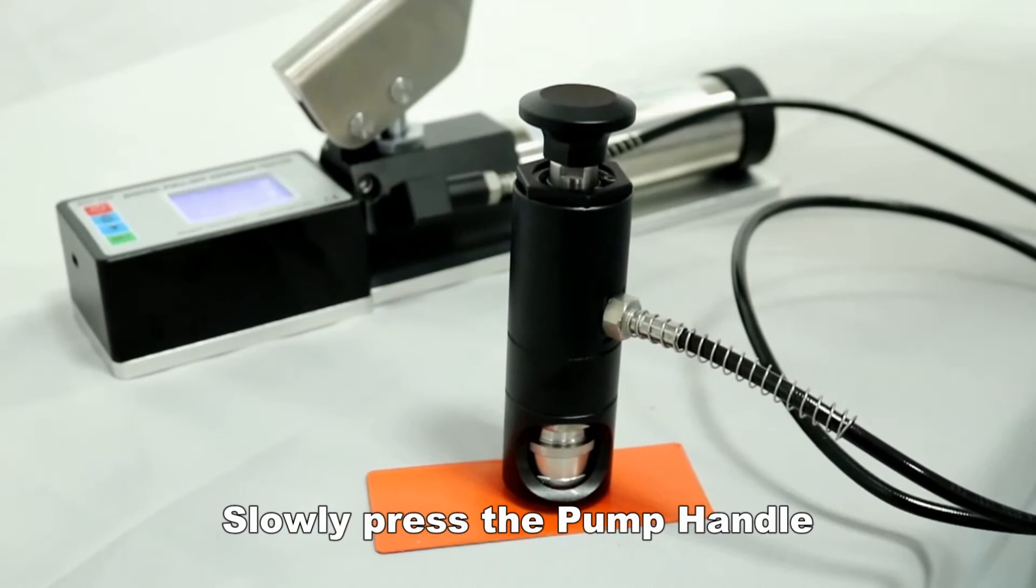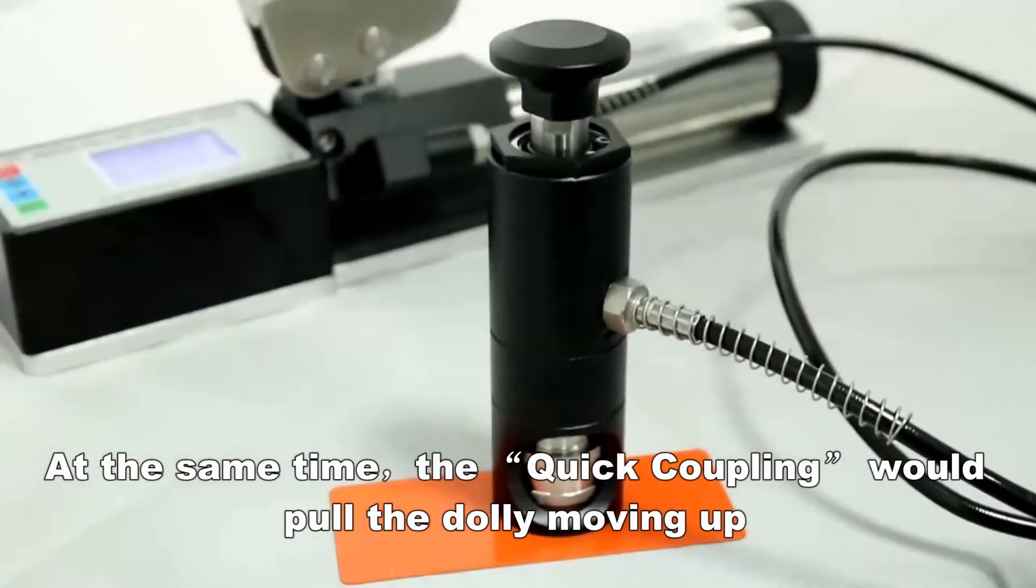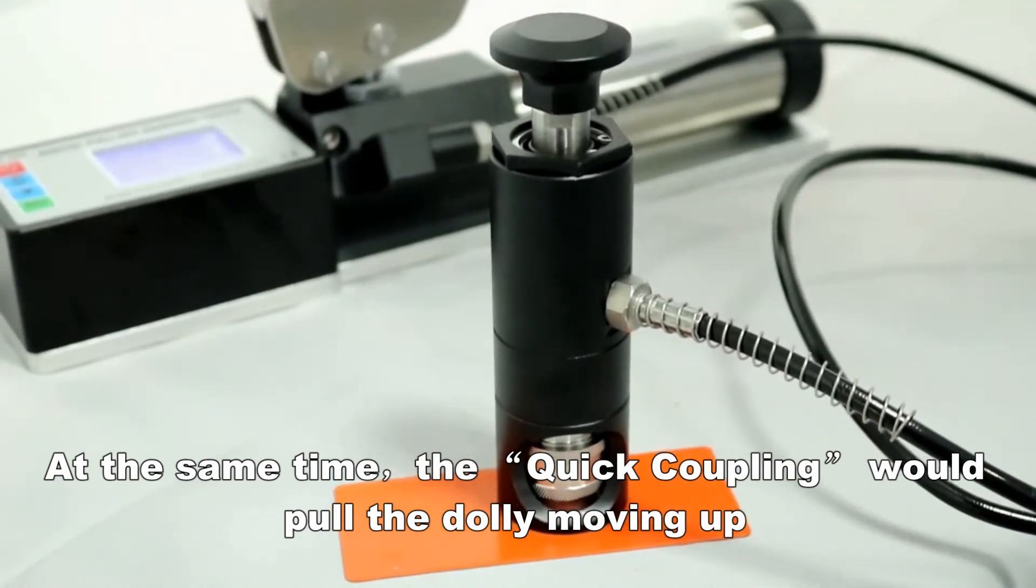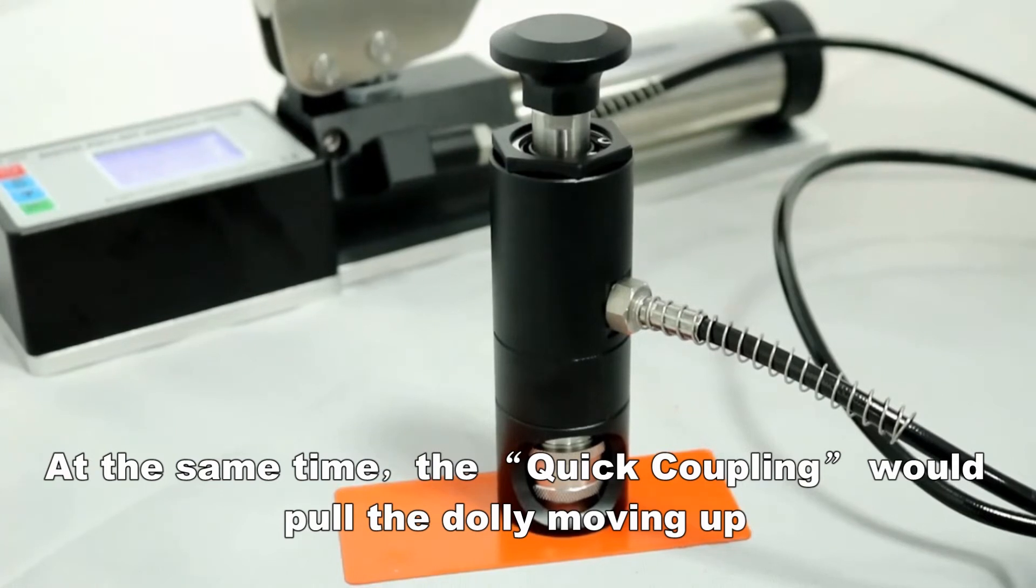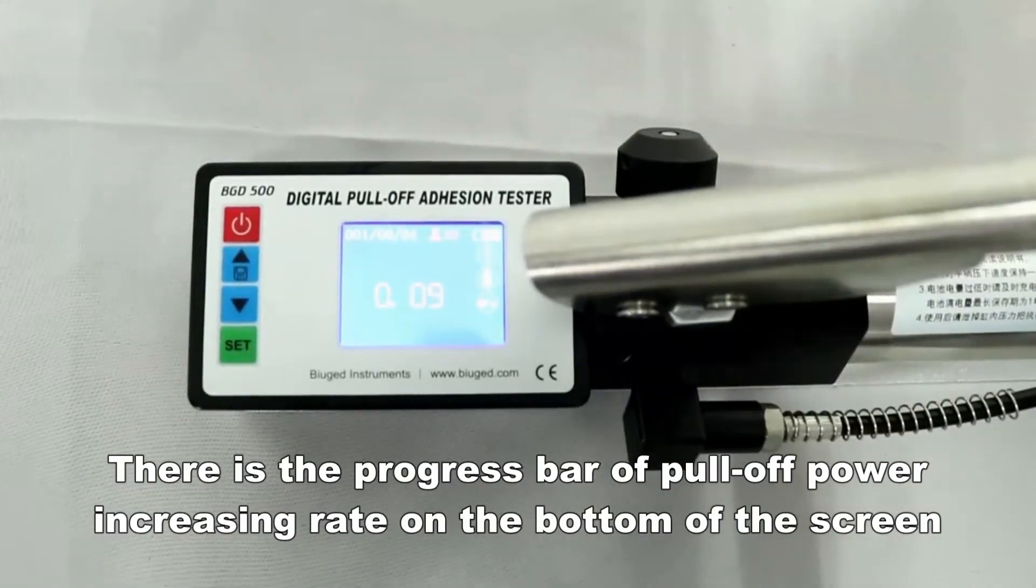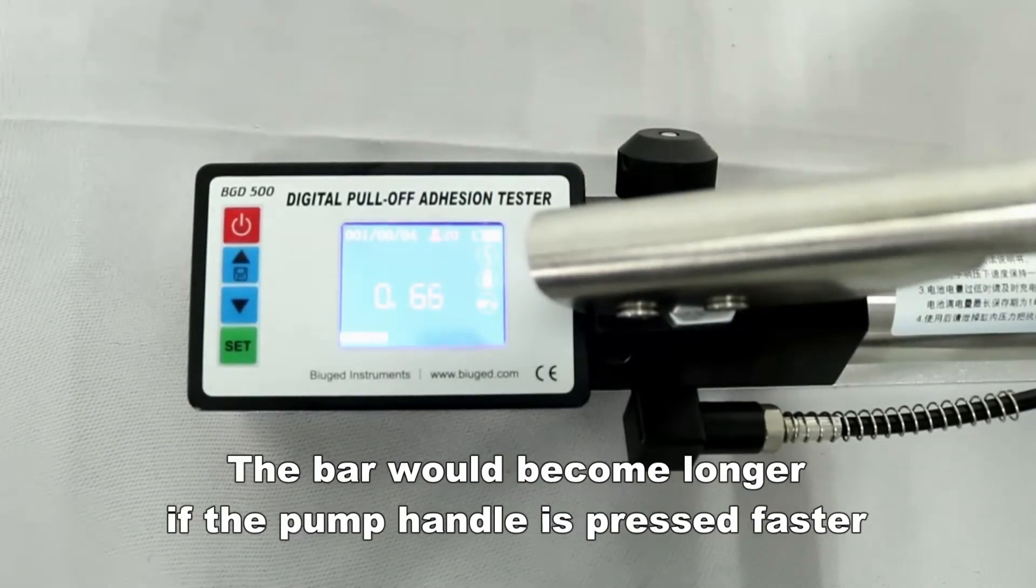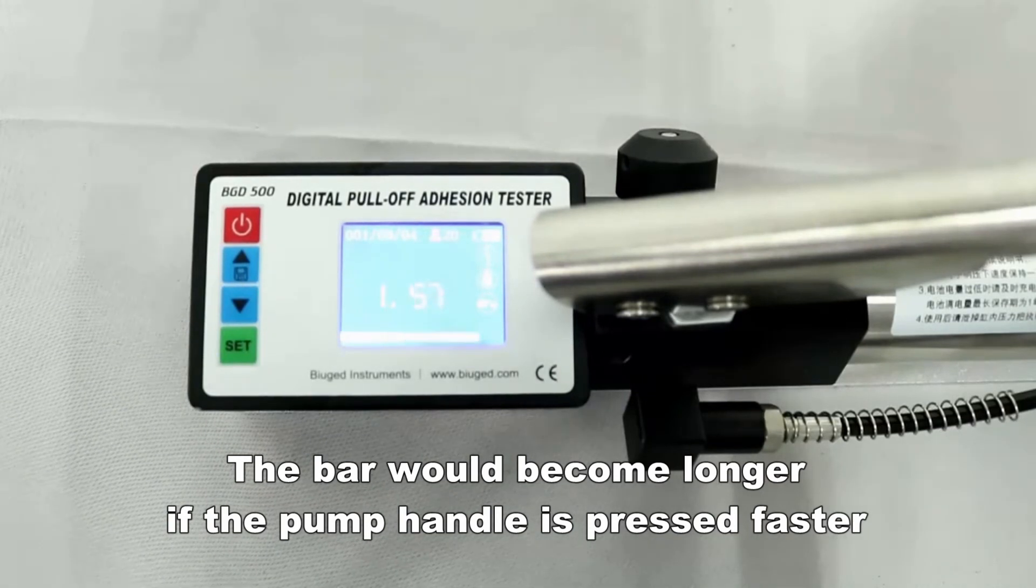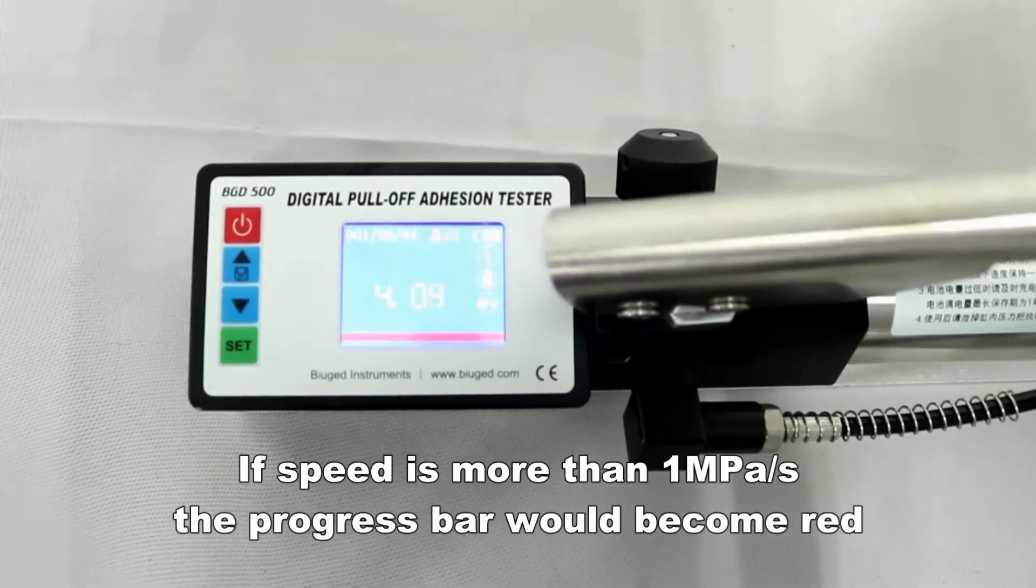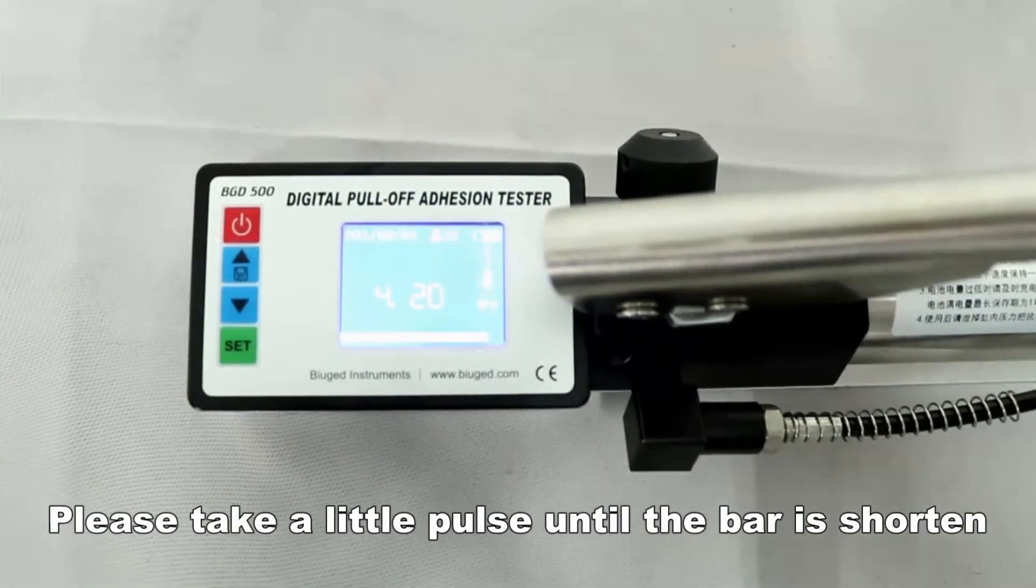Slowly press the pump handle. At the same time, the quick coupling would pull the dolly moving up. There is a progress bar of pull-off power increasing rate on the bottom of the screen. The bar would become longer if the pump handle is pressed faster. If speed is more than 1 MPa per second, the progress bar would become red. Please take a little pause until the bar is shortened.